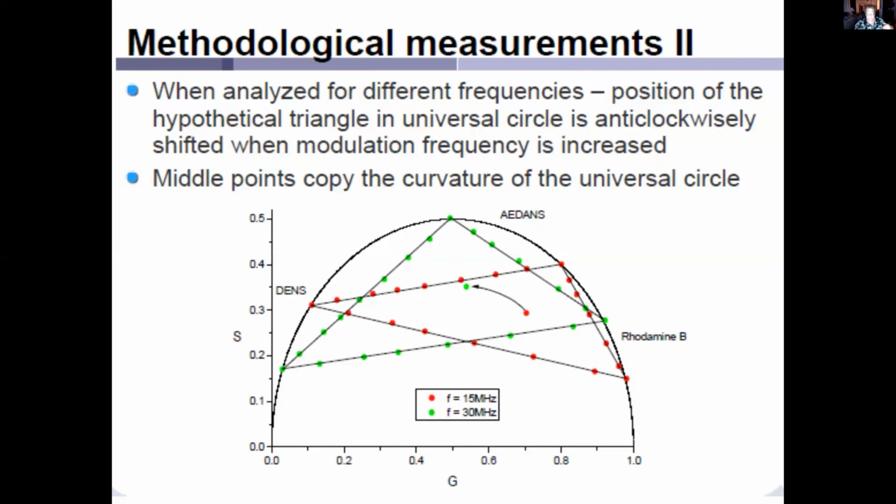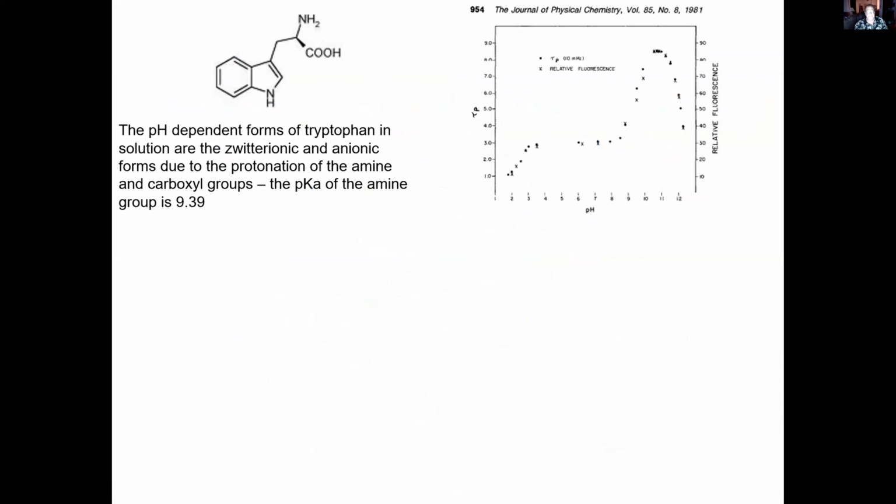The previous one was done at 20. Here's the same, these curves shown at 15 and 30 megahertz, and we see that they rotate around as you go to higher frequencies. Everything sort of rotates counterclockwise because obviously the phase shift and modulation depend on the frequency too.